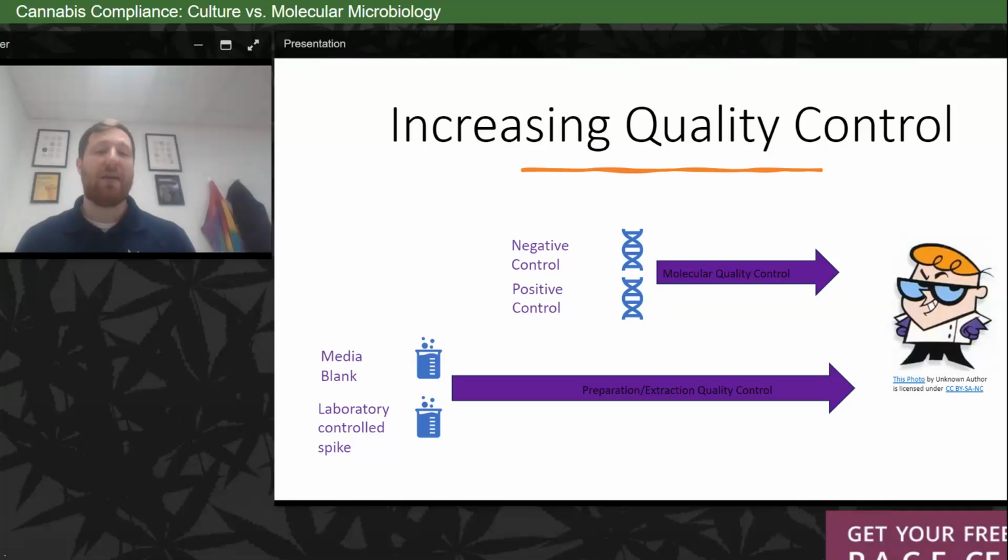You also should use a laboratory controlled spike. That's also in the AOAC ALAC Guide to Interpretation for ISO 17025, if you're going to abide by the ALAC. A laboratory controlled spike means your target organism should also be incubated with it. So in Florida, we test for total yeast and molds. We have a certified reference material that comes in a pellet. We incubate it along with the samples on the plate, obviously. So we hydrate the pellet and then we plate it onto the plate.